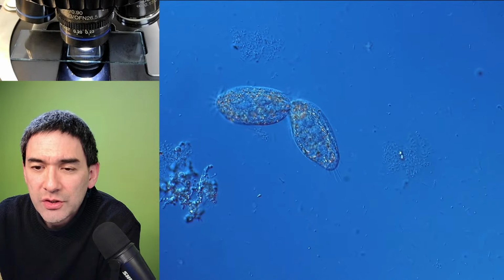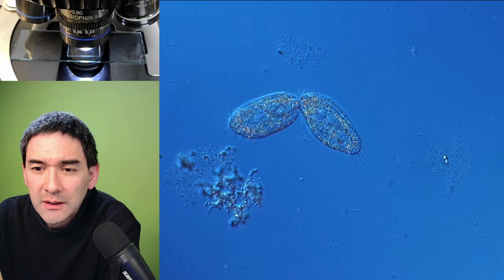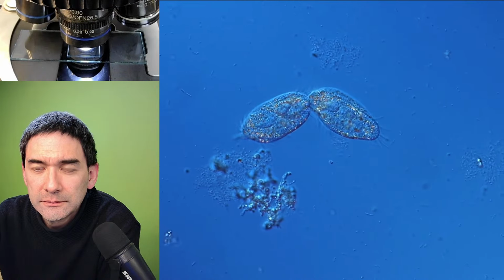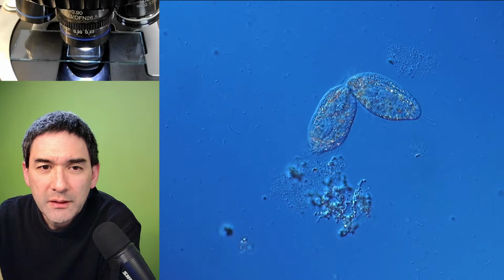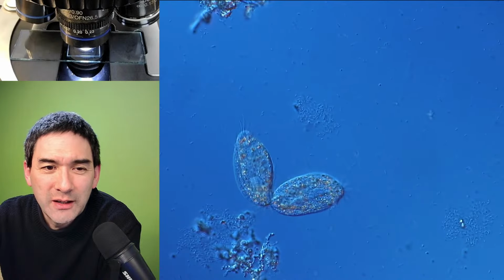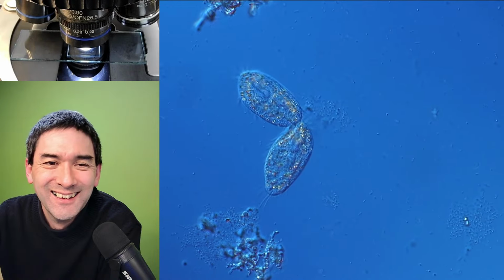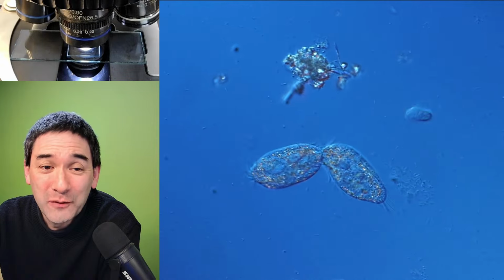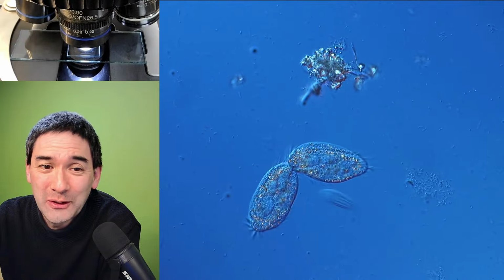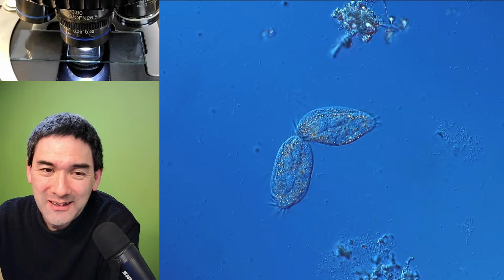I'm just reading a couple of comments here. I'm actually quite happy that. But now I actually want to wait until it divides. But then again, I've observed these things before, and it took a long time. But actually, you see that.